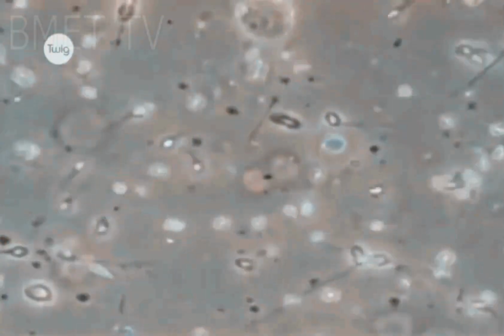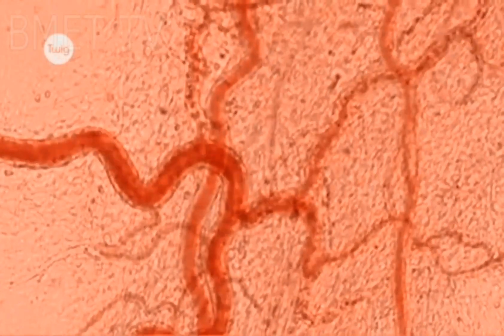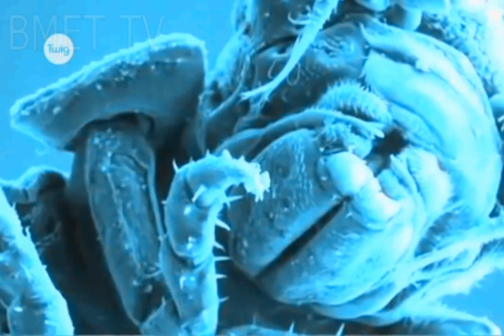These demonstrations commenced in 1663, and 2 years later, Hooke published a folio volume titled Micrographia, which introduced a wide range of microscopic views of familiar objects, fleas, lice, and nettles among them.